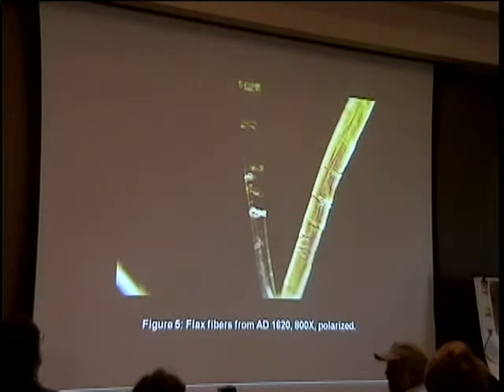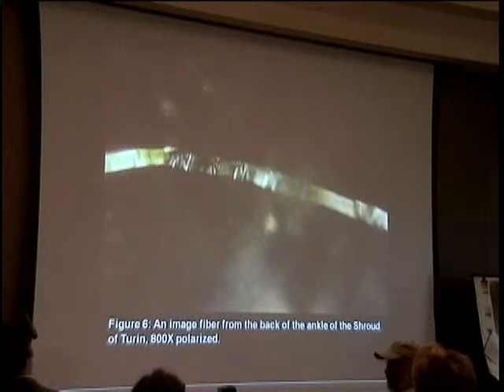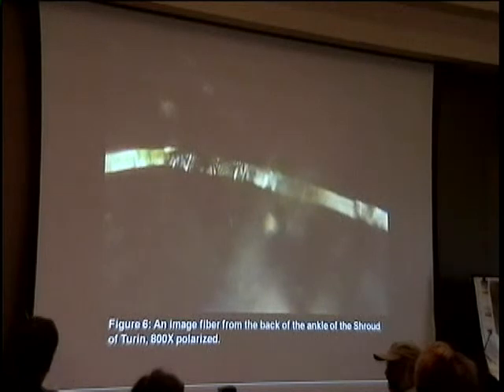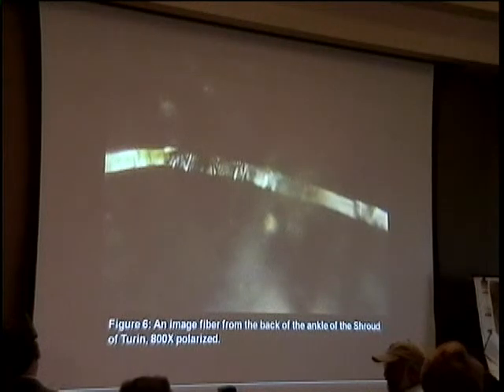Figure 6 shows a fiber that is still embedded in the adhesive of the sampling tape I used in 1978. The sample was taken from the image area at the back of the ankle of the Shroud of Turin. This view can be compared with the center fiber in Figure 3. The types and populations of defects appear to be identical. The flax in the two samples is certainly very similar in structure and production technology.